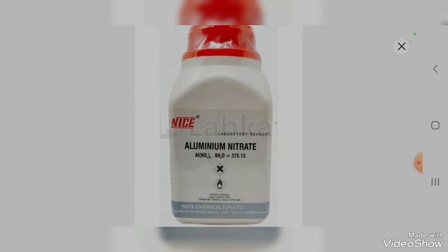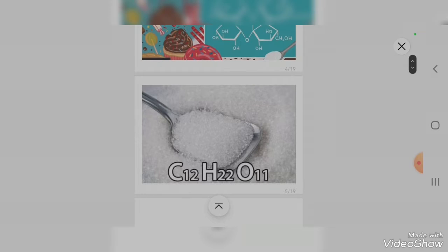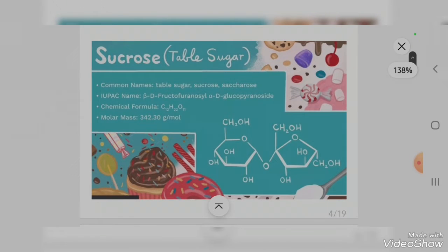In this experiment I used sugar as a fuel. You can observe here that it is the daily table sugar that we use at home. The organic fuel acts as a reducing agent. Its common name is sugar or sucrose, and its chemical formula is C12H22O11.